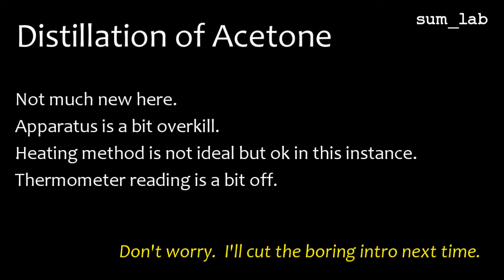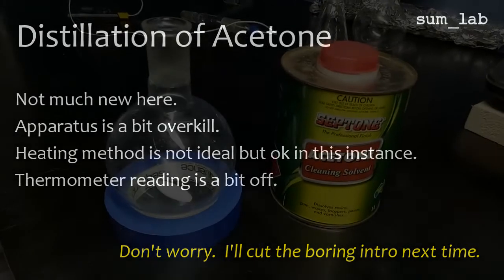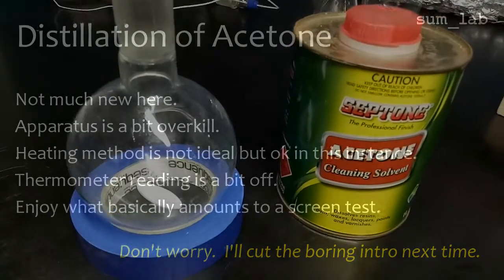I cut the distillation when the temperature began to rise. Anyway, enjoy and feel free to give feedback on this fledgling enterprise.